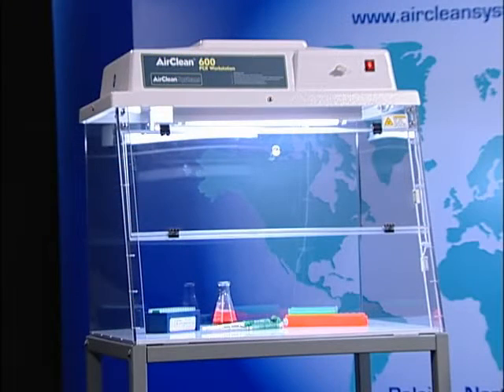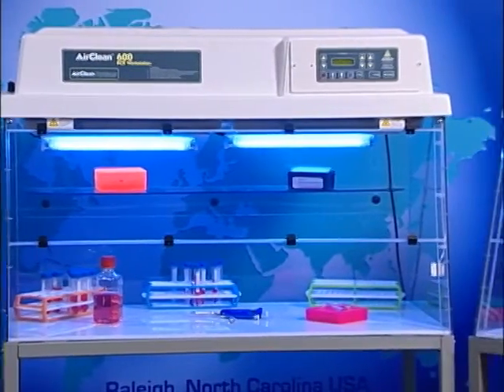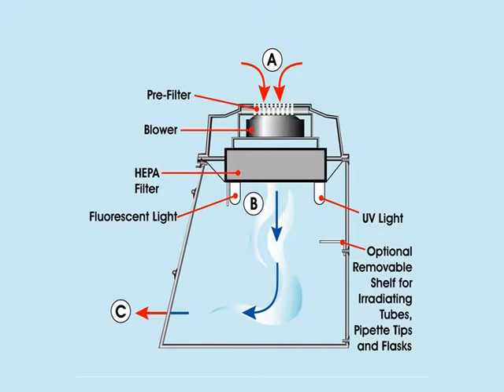The dead air box provides a small enclosed workspace that can be used for amplifying DNA and RNA. The combination workstation with UV tech controller is AirClean Systems' solution to preventing cross-contamination during the amplification of DNA and RNA. The combination workstation utilizes a two-stage filtration process, ensuring that all air within the work area is filtered to ISO 5 clean bench standards. At point A, air is pulled through the top of the workstation where gross matter is removed by a roughing pre-filter. The blower then forces the air through a HEPA filter, where all potential contamination is removed down to 99.997% at 0.3 microns. At point B, the clean vertical laminar airflow is then released into the work area, where it mixes with the application.